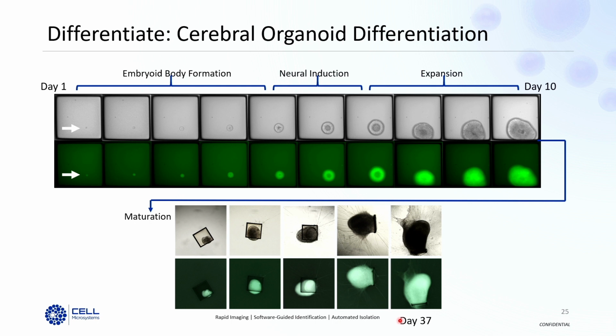My question was also about suspension cells. As you have cell propagation still in the raft state before you release them, now they're coming off the surface again. I don't quite understand that. I think this comes down to the strategy of timing. So the question is, with suspension cells, as they continue to divide, if they're not then contacting the surface, what is our strategy around taking that into account?